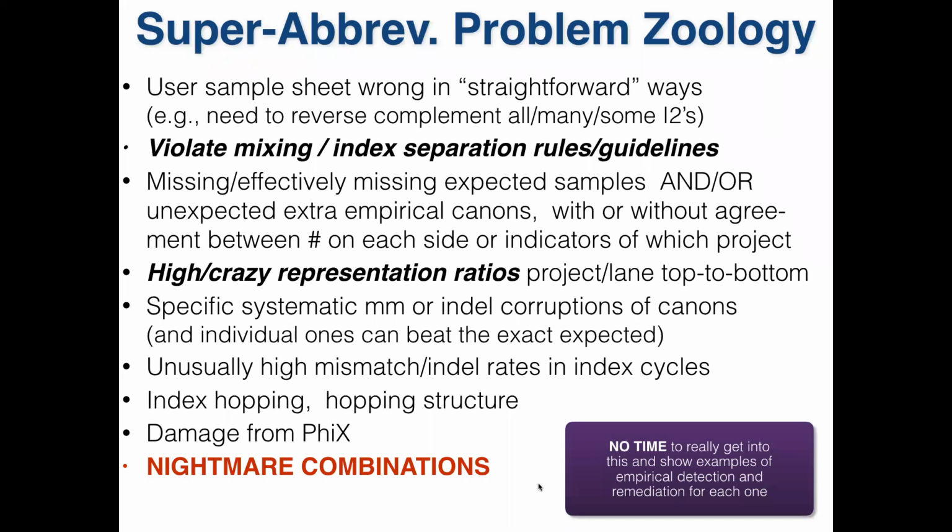Because there are so many columns in those files, sometimes some manufacturers will give you 2 columns, actually 4 columns. They'll give you the I1, I2 for one set of machines, and then the I1, I2 for another set of machines. Those 2 I1 columns are exactly the same. But some people get the columns mixed up and somehow give us 2 copies of I1. So you may have a sample sheet where it's 2 indexes with the same sequence down, things like this.